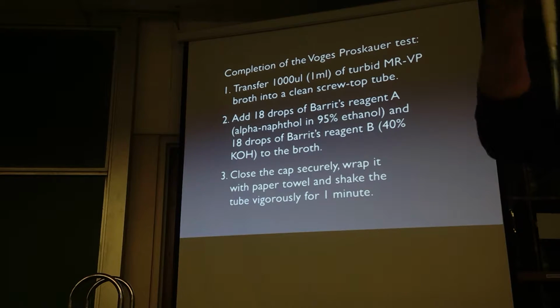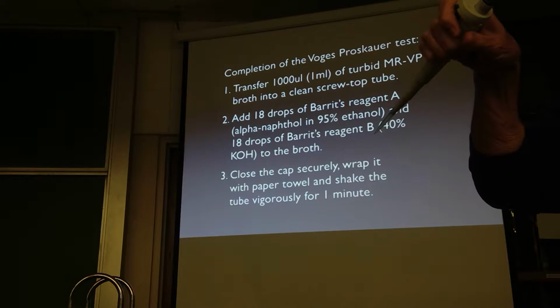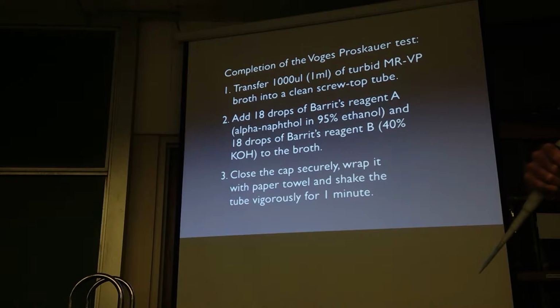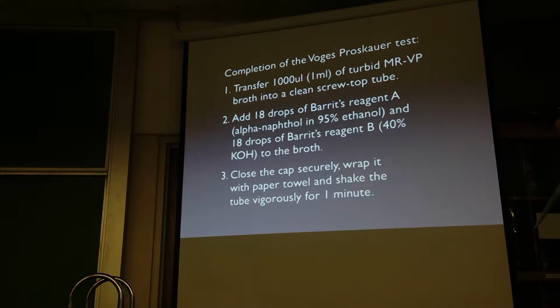Now, to use this, first of all, you want to make sure that it's measuring the right volume, which this isn't. It says it's going to measure 300 microliters, and I want to measure 1,000. To make it change, you press this little button. If you're familiar with a standard transmission on an automobile, you don't change gears without putting the clutch in.